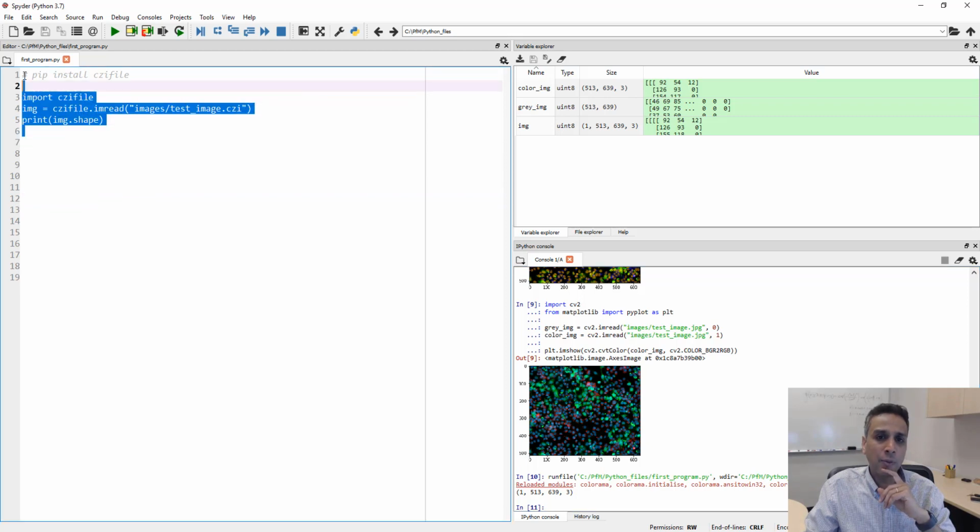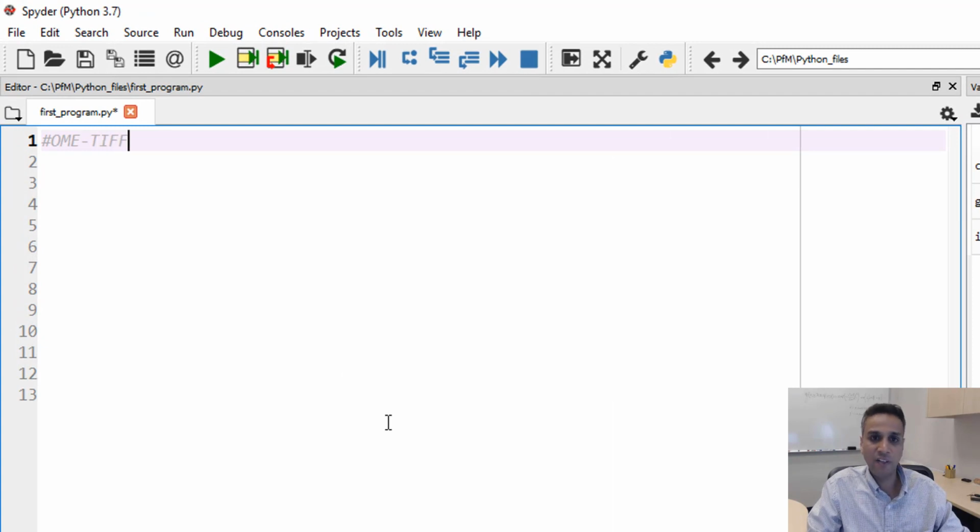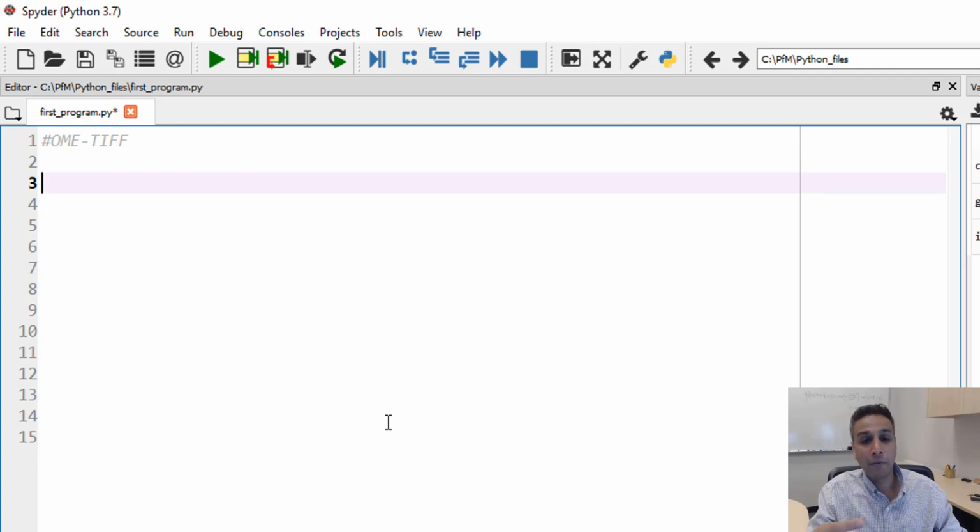And the other one I mentioned is the OME-TIFF format. Go ahead and Google search to learn more about this format. And if you do use OME-TIFF, again, there are a couple of ways. I should admit that I am currently working on a project. I work at Carl Zeiss right now, and as part of that project, we had to find a way to read OME-TIFF images, and that's why I plan on including that as part of this tutorial.